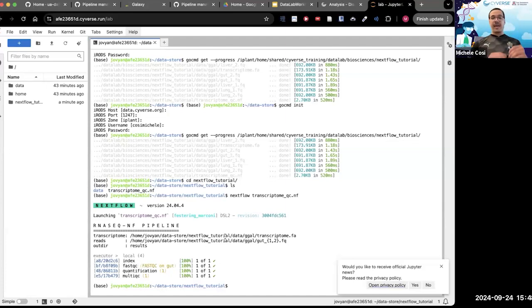They are given a funny little name, such as A8. And then within A8, I'm going to show you in just a second, there is a really long string, and that is, in a way, where your working folder is. However, this does have a name, and that is index, and then it will also tell me when it is done.